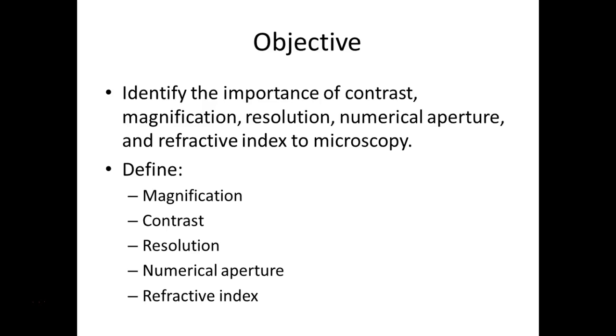Just like for people who need corrective lenses for glasses, you have a prescription that lets them know how to make that lens to correct for the lens in your eye that's not working properly, so you can see clearly.